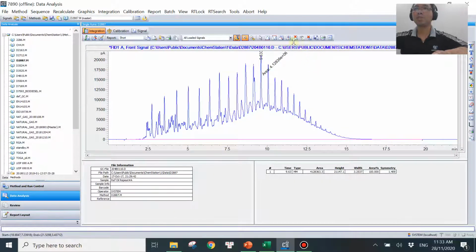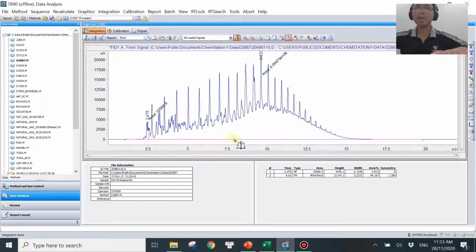So what you do is just click this one and then start somewhere. I'm not going to start somewhere here because I know for sure it's more than 0.5%, right? So it doesn't make sense that you start somewhere here. So you start from the left to the right. Let's say I want to start somewhere. Just click somewhere here. Then what do you get from here?